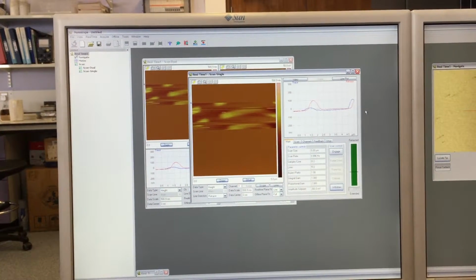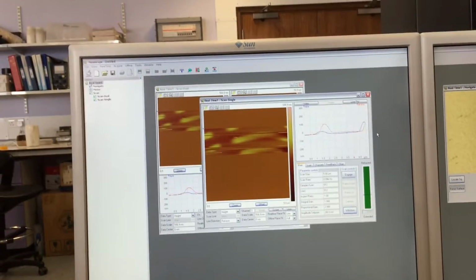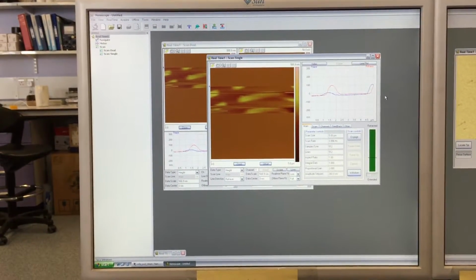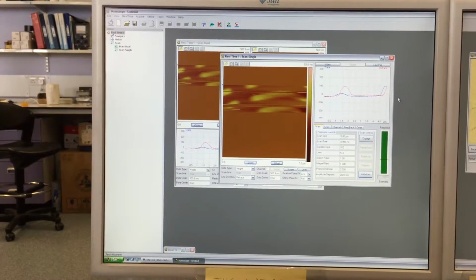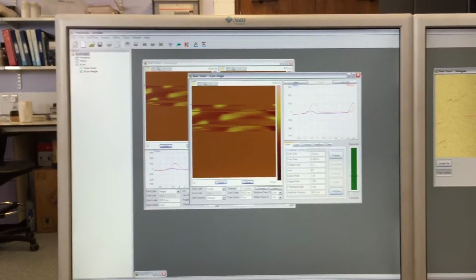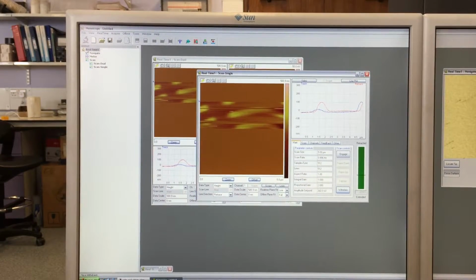You can do a constant force contact mode. For conductive AFM, you really have to use the contact mode because you need the tip to be in contact. Yeah, but I was thinking maybe a softer sample, organic. Yes, the tapping wouldn't etch, but it would just deform the sample if it's soft. If you have fibers and things like that, I've done that with Sal before. You just drag the fibers along with it.